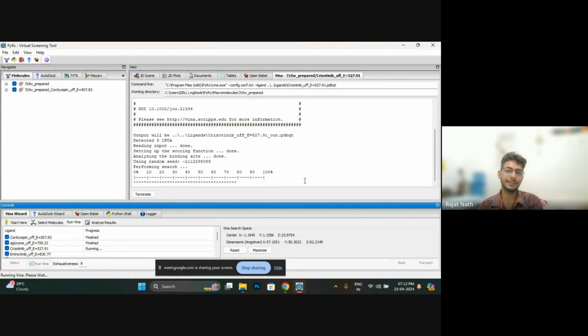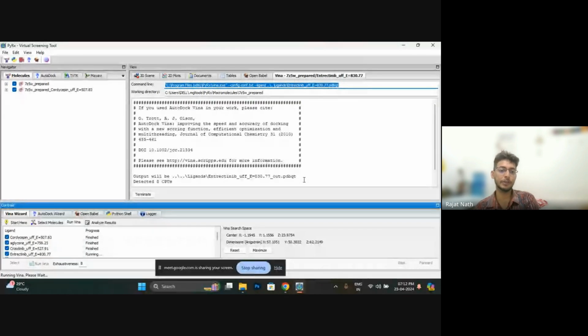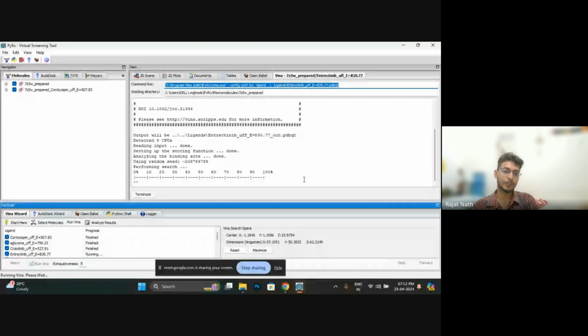You can see this software is using AutoDock Vina, Open Babel, and all the different software used in molecular docking, compiled in one place. Open Babel we used as a single software to convert the ligands in our first or second classes. Here they have incorporated Open Babel to convert the compounds into PDBQT format, AutoDock for docking, and the AutoDock Vina wizard for the docking analysis.